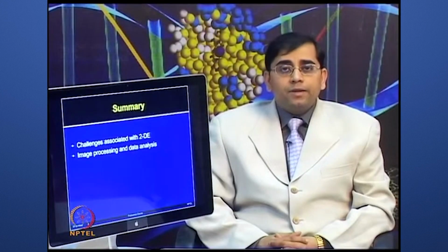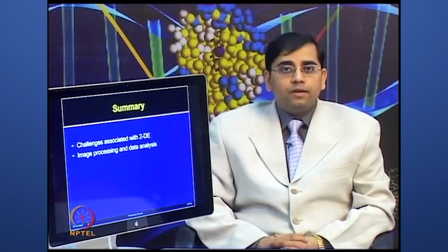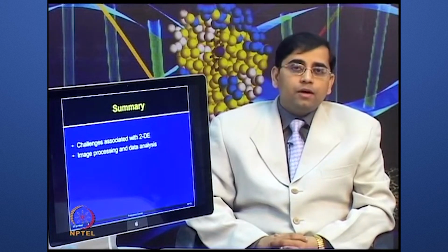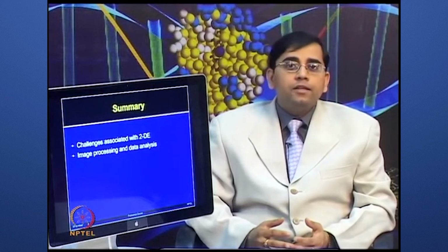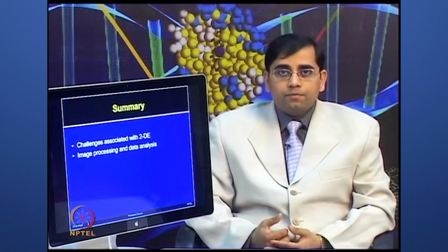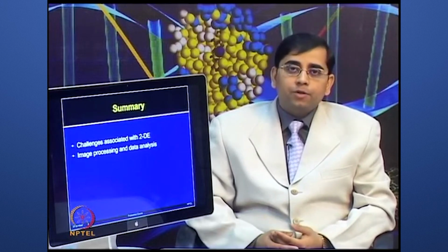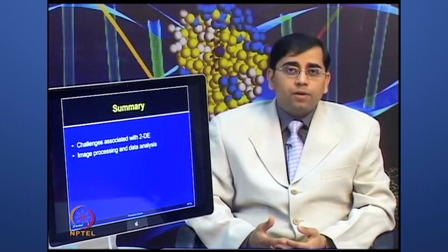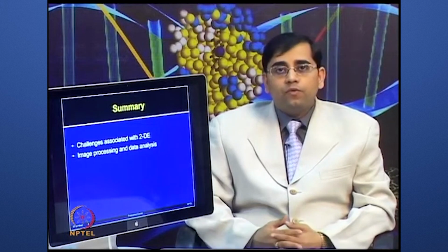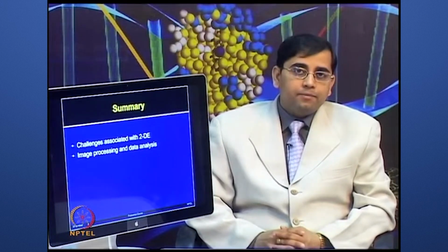At the end, you must appreciate that one needs to do different types of statistical analysis to ensure that the identified spots can really be pursued for research, and those are going to be further processed by using mass spectrometry. If they can provide some meaningful information, then one needs to have full confidence. That is why we need to do a statistical analysis beforehand.